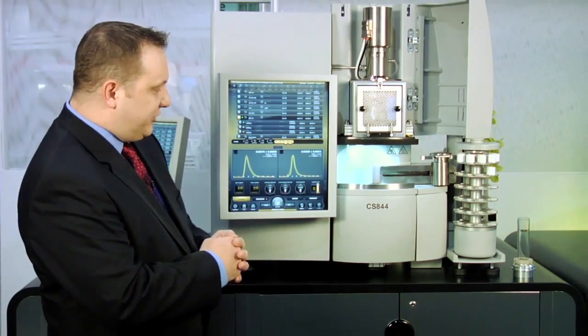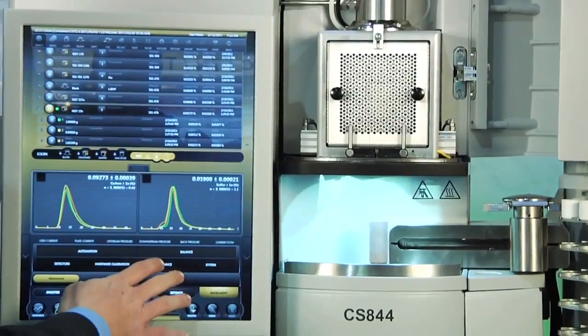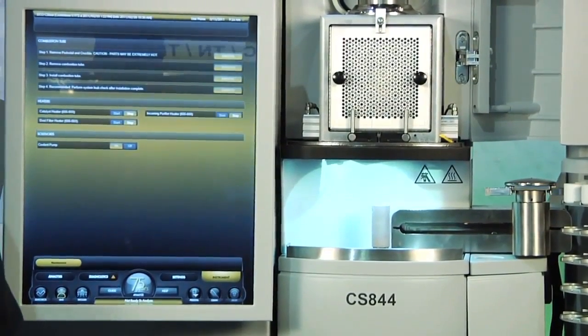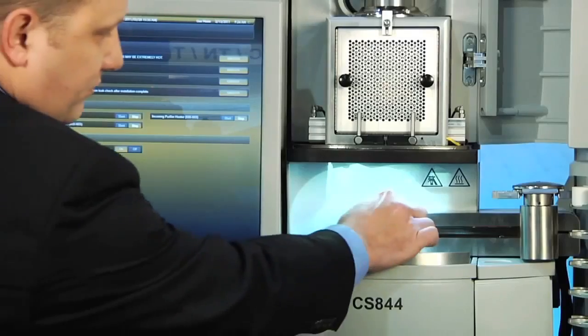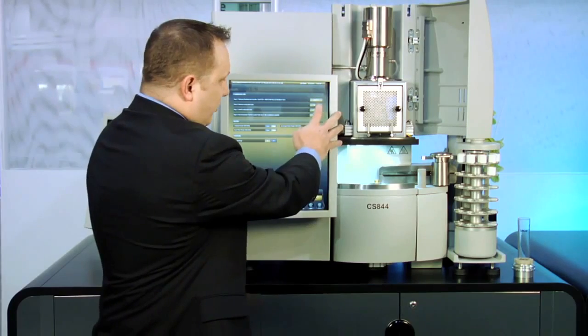I'm going to go into the instrument software and enter into a maintenance section. This is going to give me four prompts. The first would be to remove the pedestal and crucible if present. The second would be to remove the combustion tube itself with a single execute command.